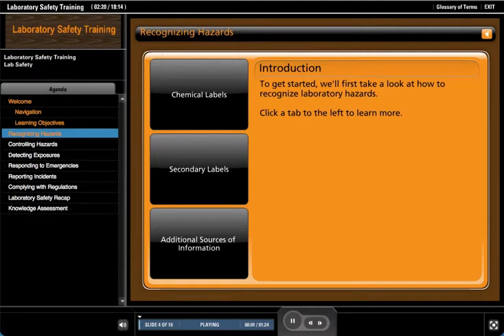To get started we'll first take a look at how to recognize laboratory hazards. Click a tab to the left to learn more.